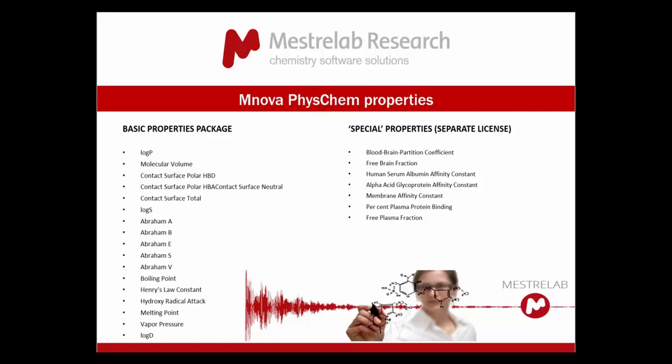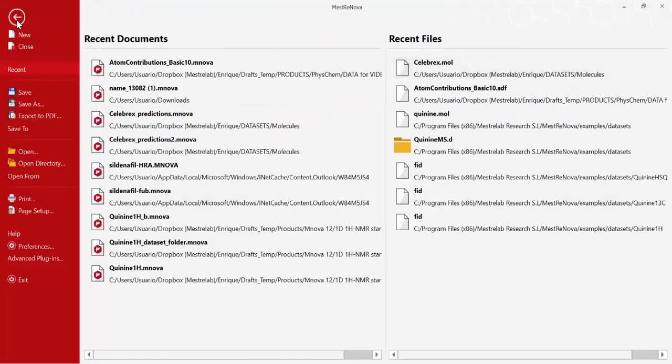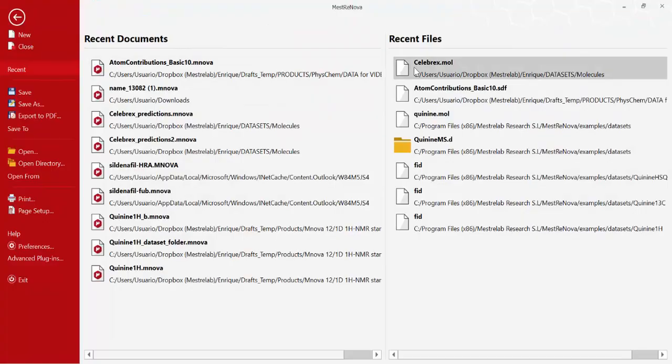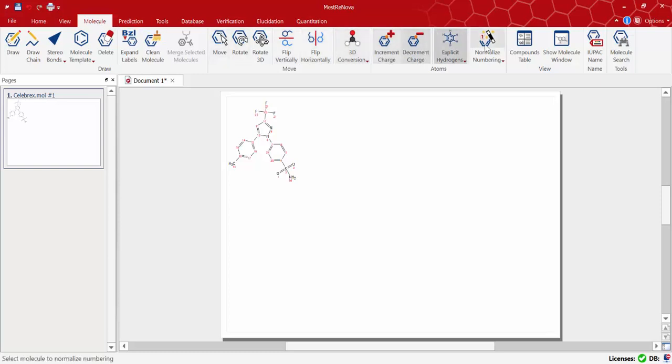The first thing I'm going to do is open a structure file in MNOVA. In this case I just need to go to file and retrieve the mol file of Celebrex structure. I'm using the recent file section however you can always browse the file on the computer. As you can see the structure is automatically opened in MNOVA's molecule tab.